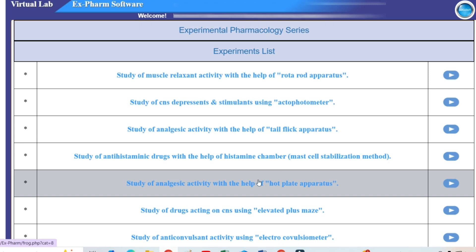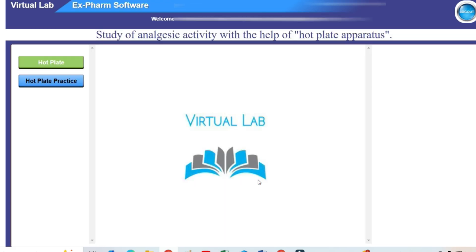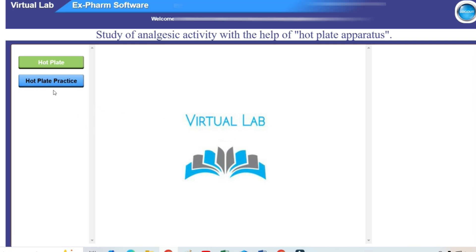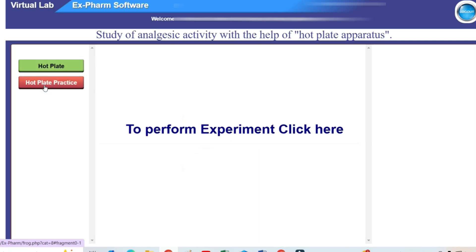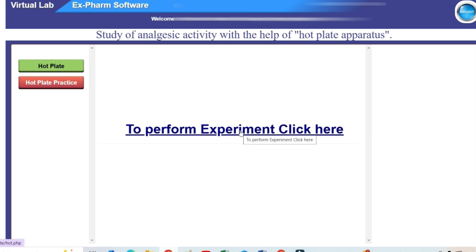We will click here. You can see the interface has two buttons: hot plate and hot plate practice. We will click on hot plate practice. You will find your link that you have to click now.